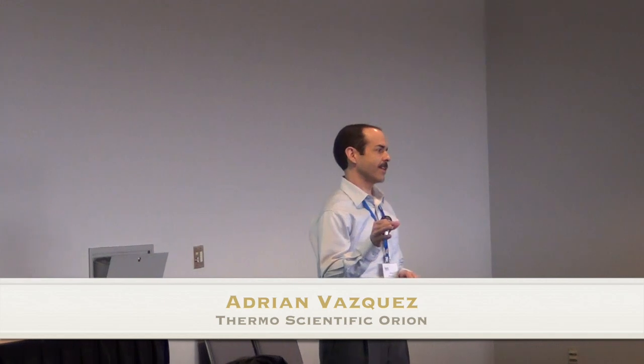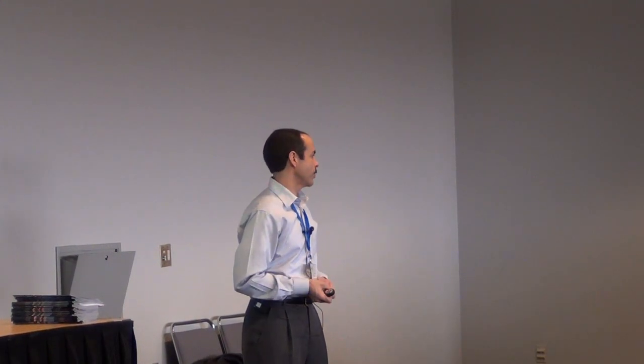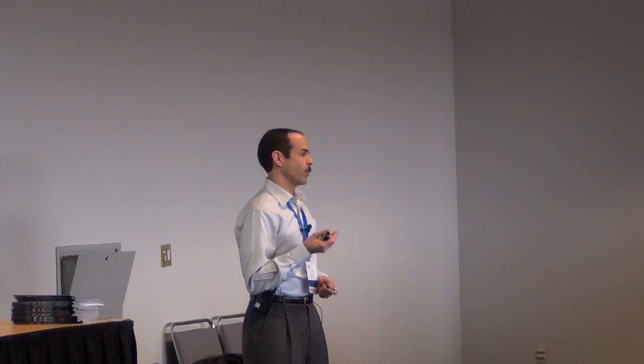I have a couple of theory slides. It won't be too bad, I promise. This is one of the theory slides, and it's really about letting you know what pH is, and when you're measuring pH, what you're doing.